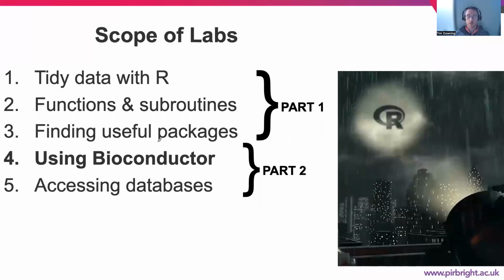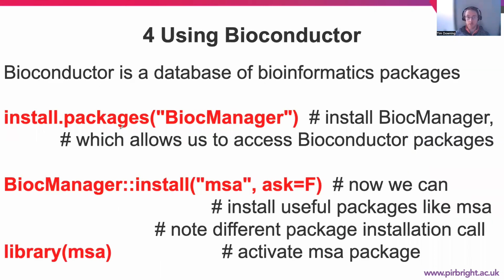So welcome to our fifth video in the B07 using R packages series. Here we're using Bioconductor, which is a very powerful suite of bioinformatics packages that we can use. Bioconductor can be called using this particular command. We install.packages and we install a tool called BiocManager. BiocManager is a particular nickname for Bioconductor in essence.